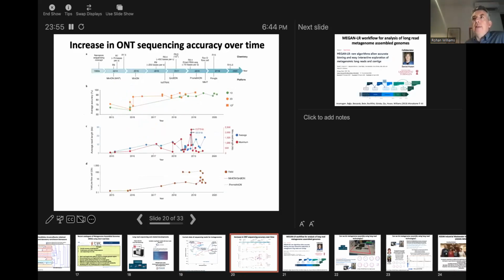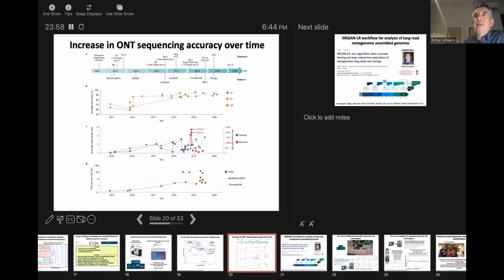The problem with this is that until very recently, these long read technologies had very, very high error rates. So back in 2015, if you'd asked me at the time about Oxford Nanopore, I would have said this is very much a toy technology and it wasn't serious. And then I think the tipping point was somewhere in here. All of a sudden, the error rate, or the accuracy, started increasing.